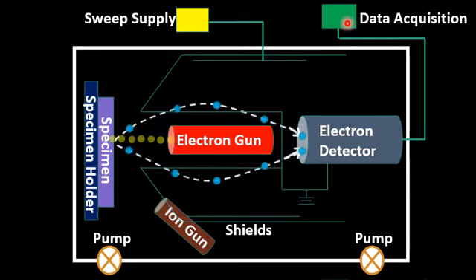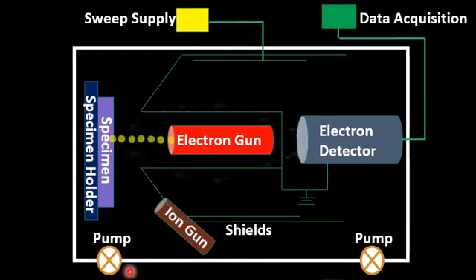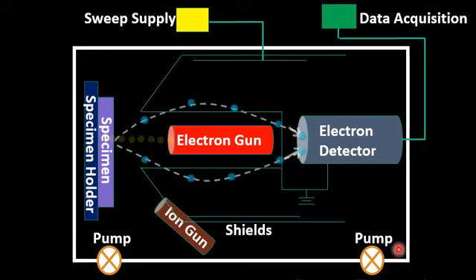If I simply conclude the Auger electron spectroscopy, students, please note that the Auger electron spectroscope consists of an Auger electron chamber. The Auger electron chamber is highly evacuated by a vacuum pump. The vacuum present is in the range of 10⁻¹⁰ torr.